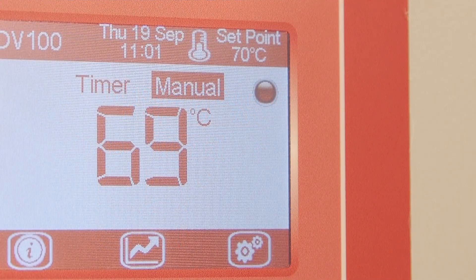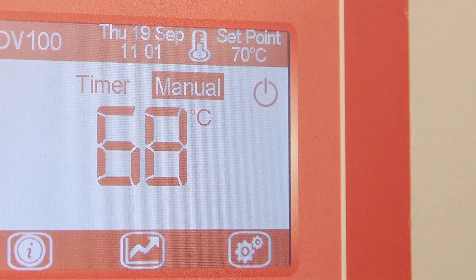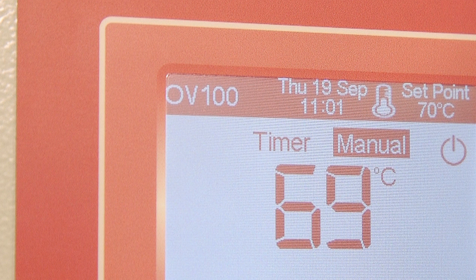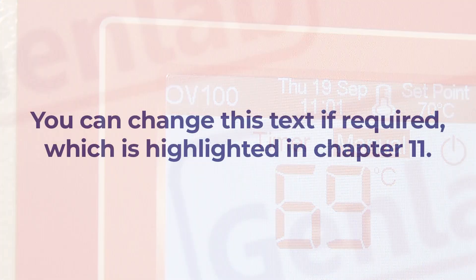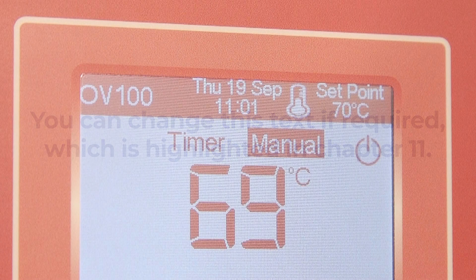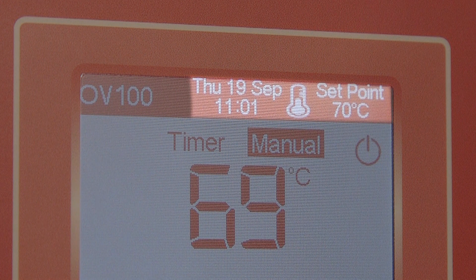To turn the oven off, press this red button and the symbol changes. The oven will go into standby mode. The top left text shows the oven model code — you can change this text if required, which is highlighted in chapter 11. We also show the current date and time along the top, followed by the current set point.